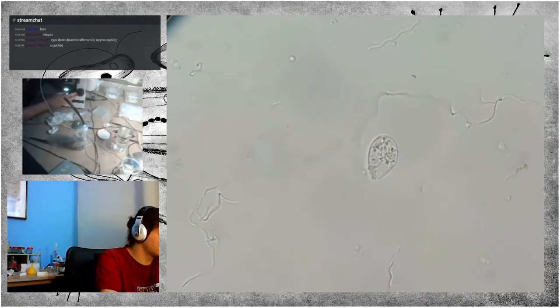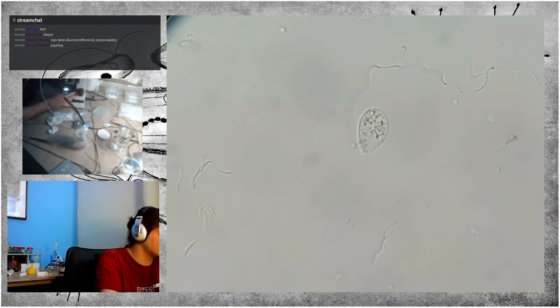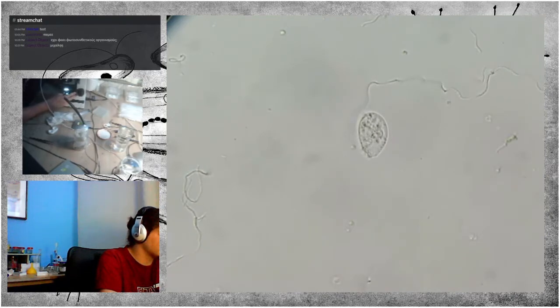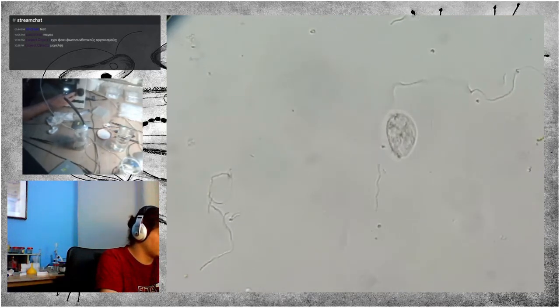Water wants to dissolve all the things inside the cell and wants to rush in to lower the concentration, to make it similar or identical to the outside concentration of molecules. And essentially the contractile vacuole is a mechanism to counteract that.